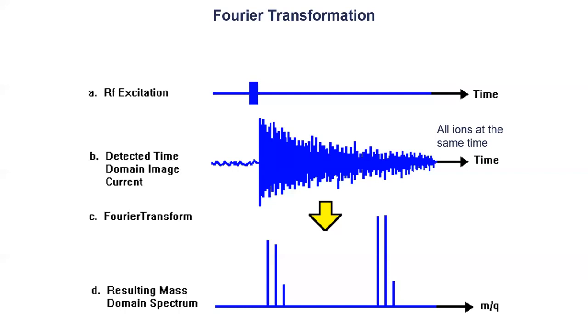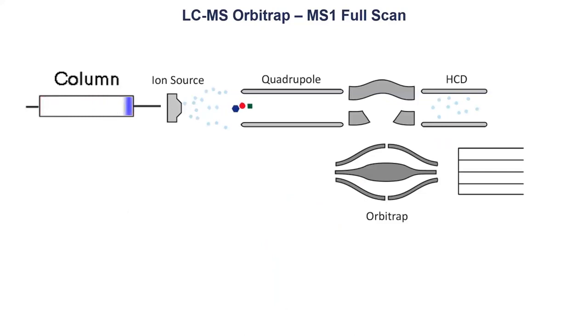So we actually see how much processing is already behind those things. This is also something you always need to be aware of. When you see raw data, they are of course not really raw anymore, because you have already some computational algorithms and optimizing in these steps as well. This is the whole setup.